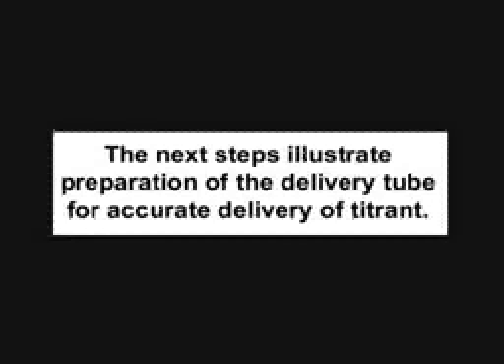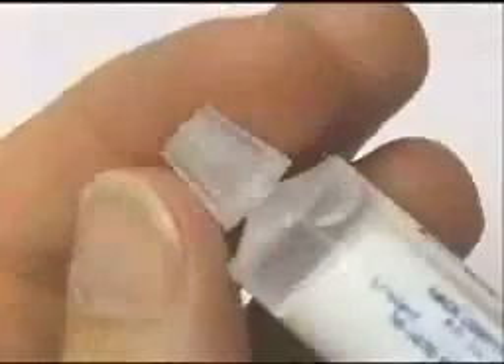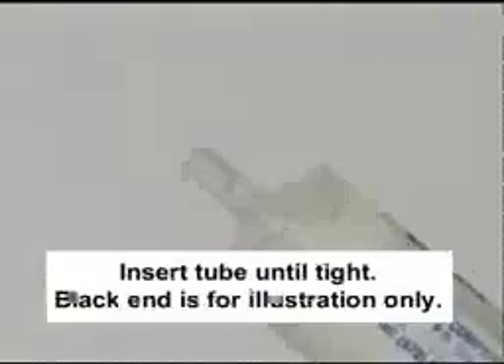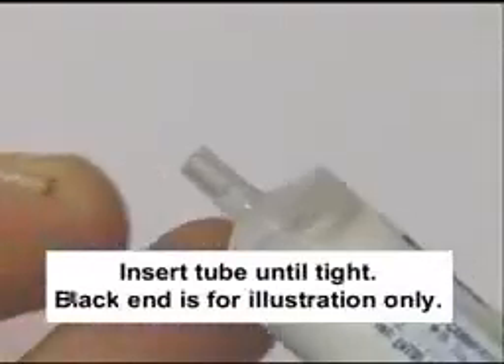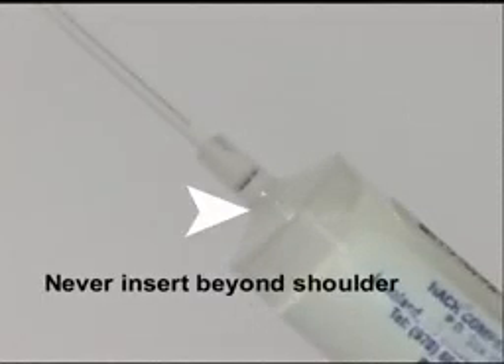The next steps illustrate preparation of the delivery tube for accurate delivery of titrant. Insert the tube until it is tight. The black end is for illustration only. Never insert the tip beyond the shoulder.